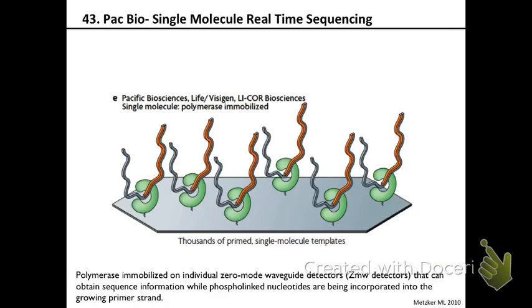All right. So in both Illumina and a lot of technologies, what we have is the DNA polymerase, right? That's freely going into the template and starts adding nucleotides. So that's how Sanger sequencing is done, how Illumina is done.